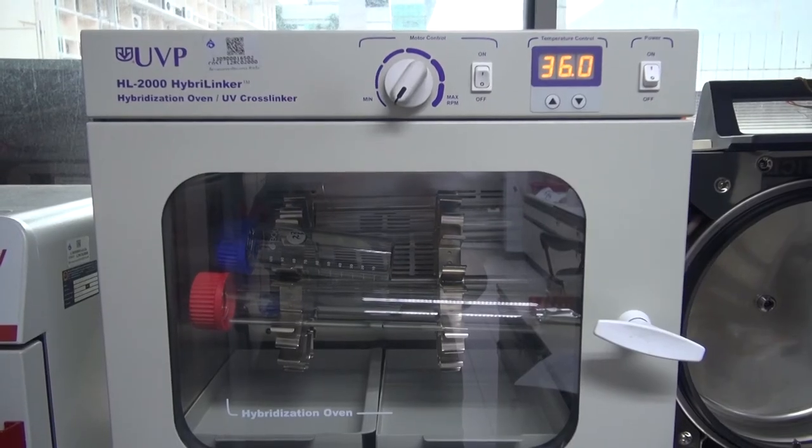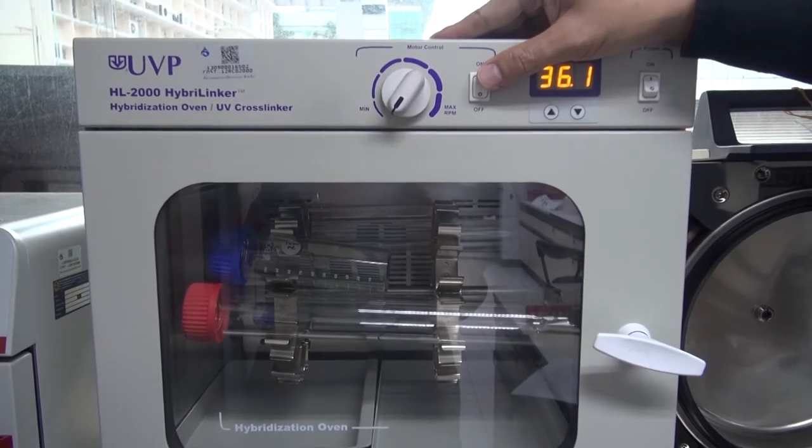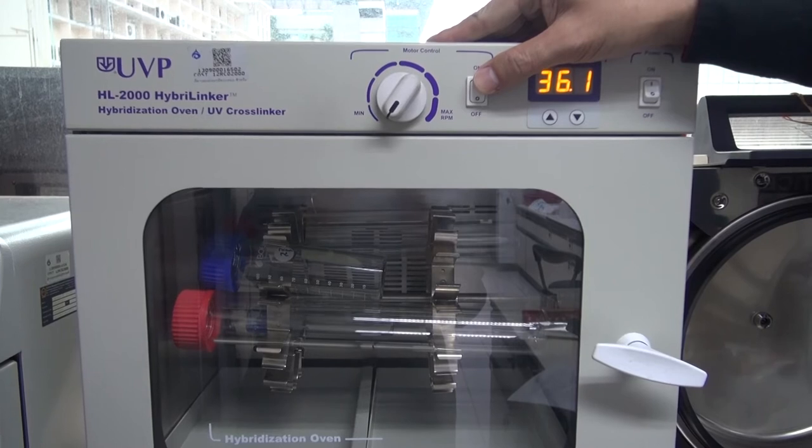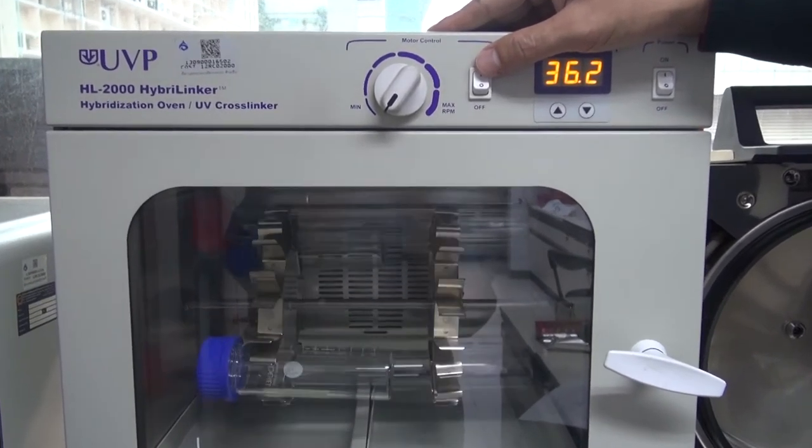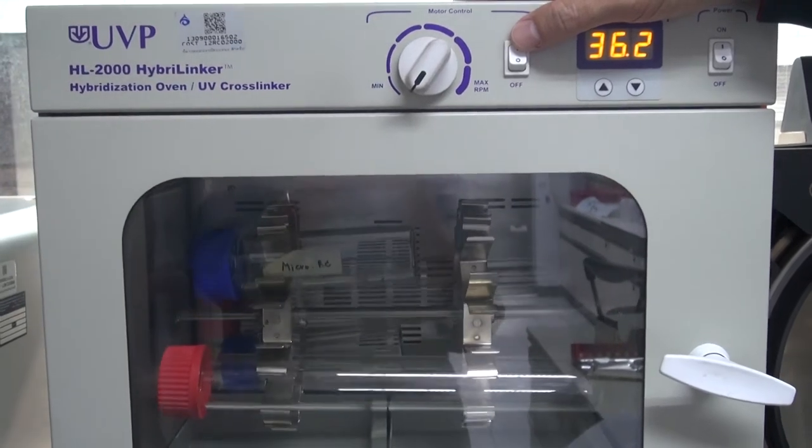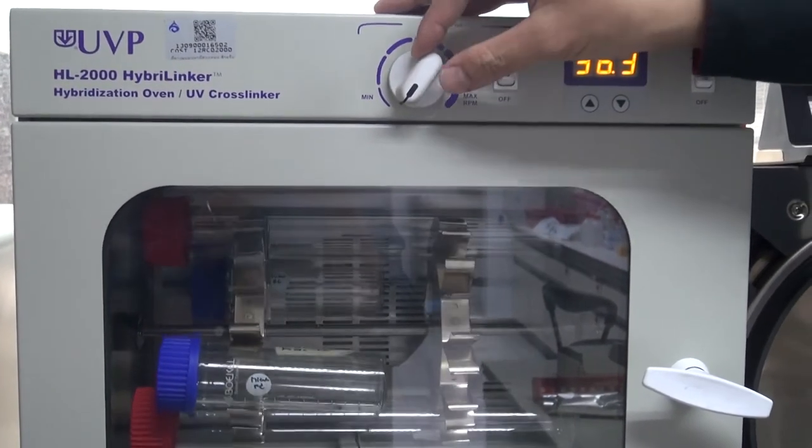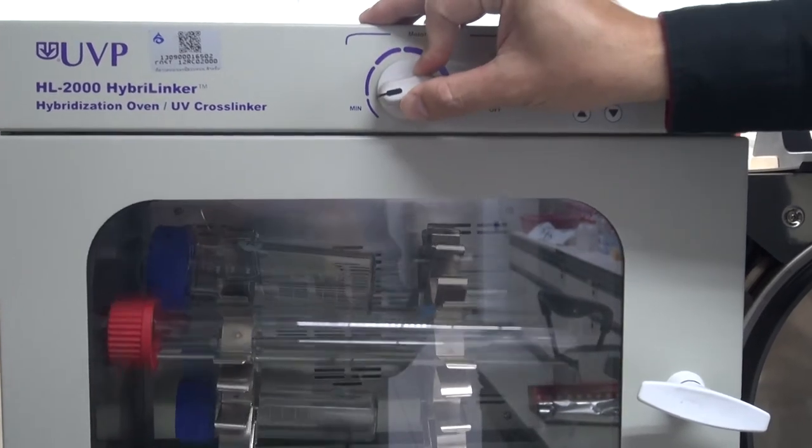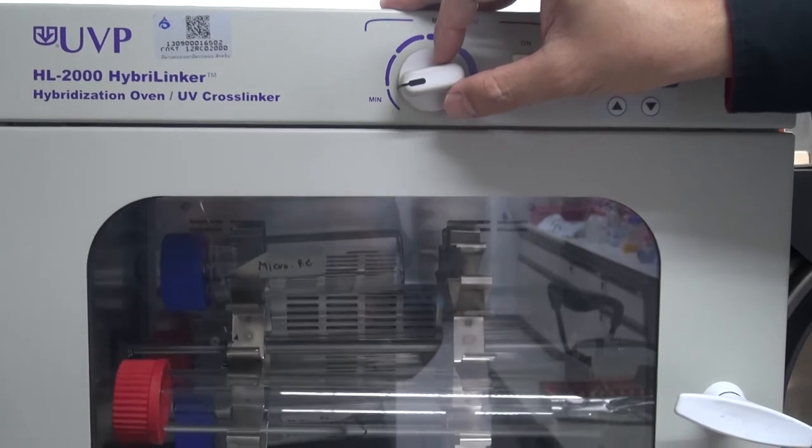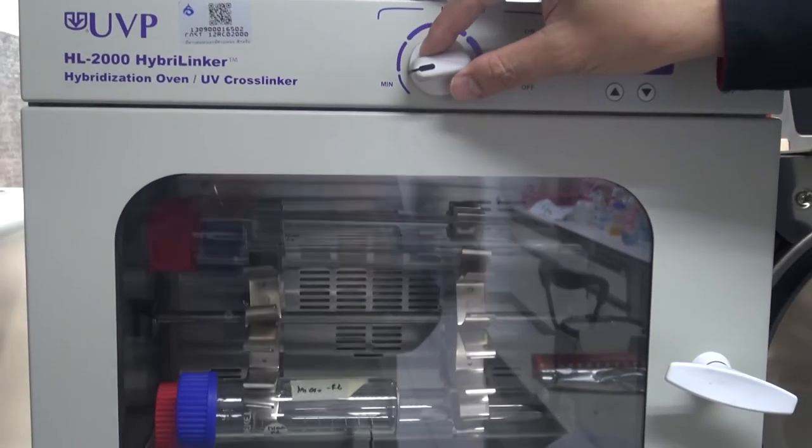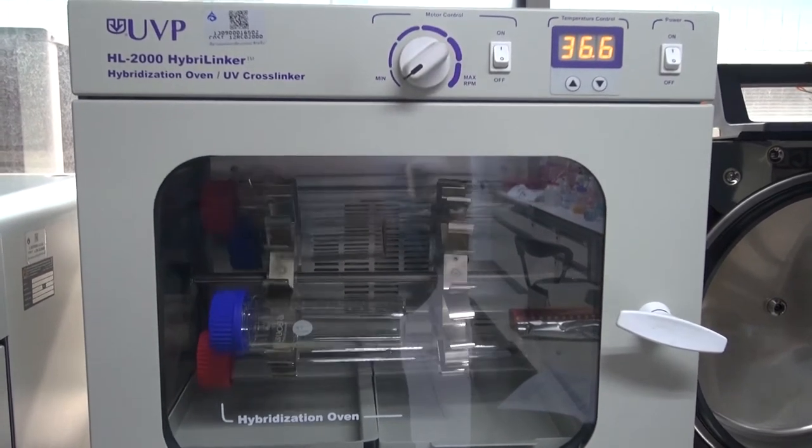To turn on the motor for the bottle carousel, press the motor control power switch to the on position. To adjust the bottle carousel to desired speed, simply turn on the control knob clockwise. To lower the rotating speed, turn the knob anticlockwise to suit different hybridization conditions.